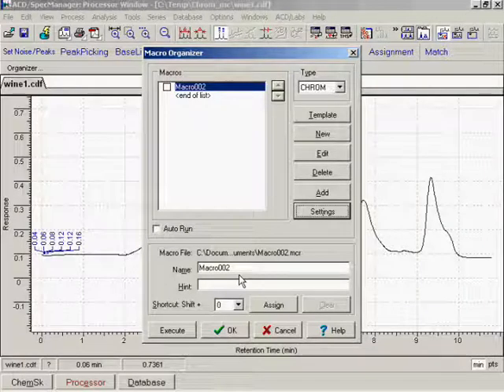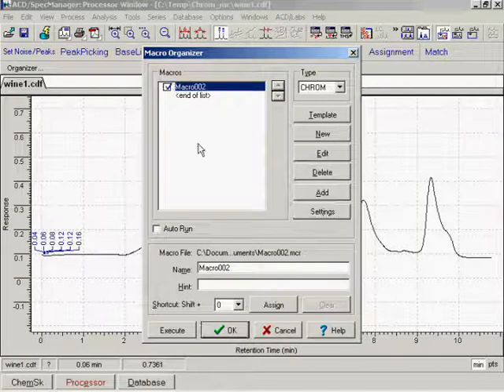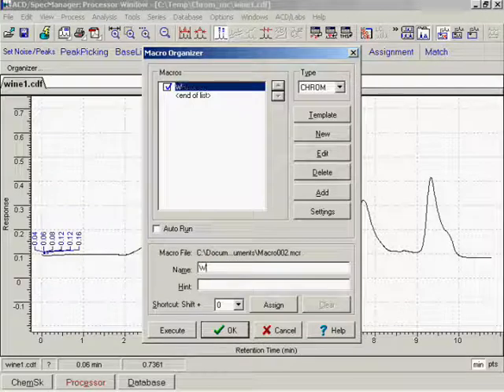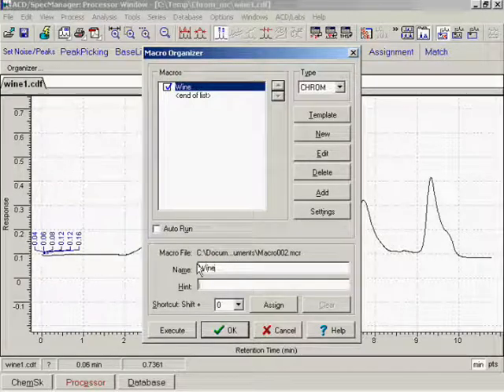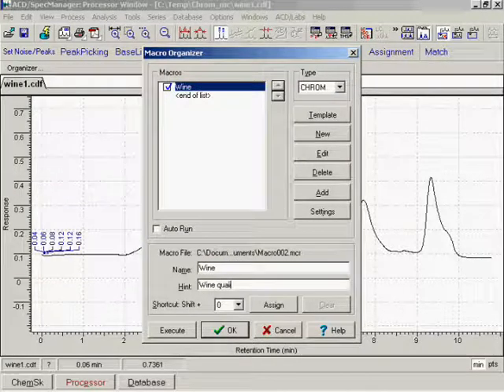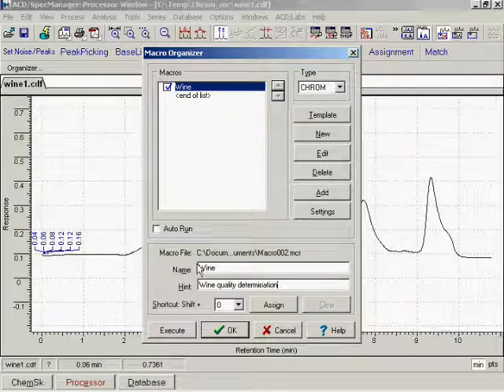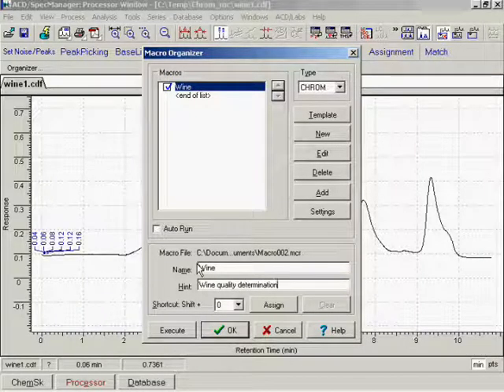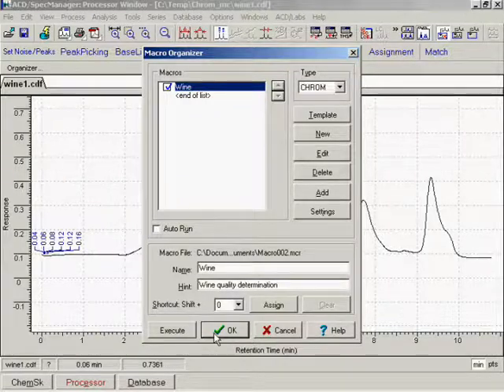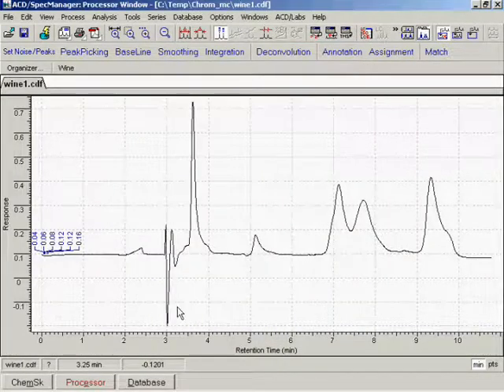To place the macro on the macro toolbar, mark it with a blue tick and specify its name, and the comments to appear on the yellow popup tag. Now we test it.